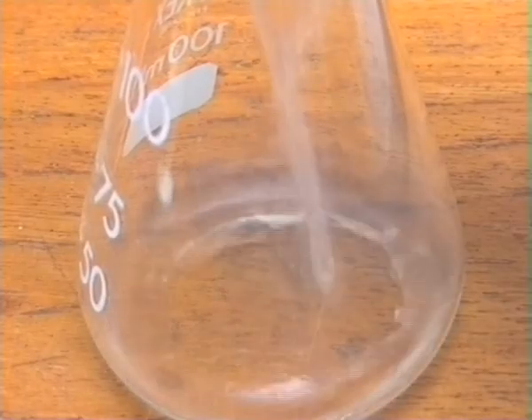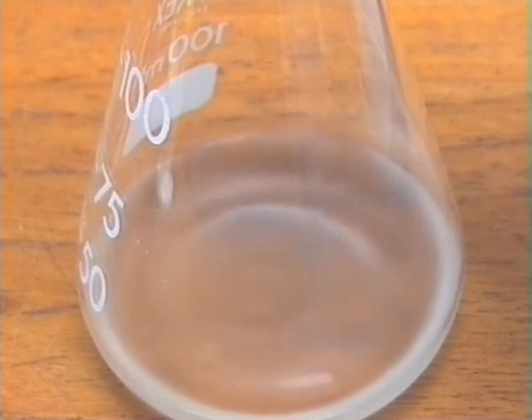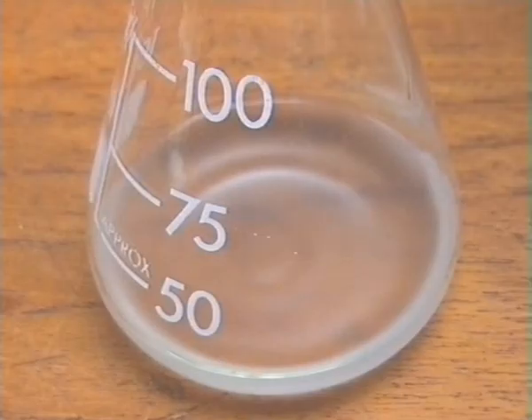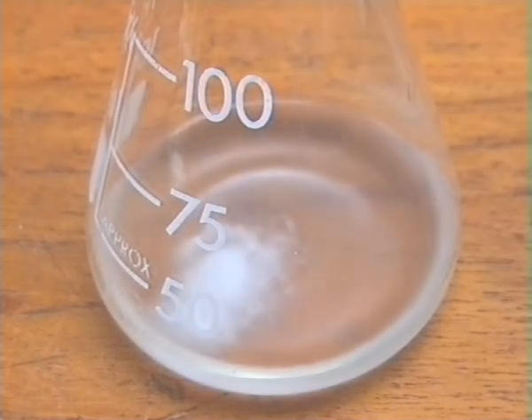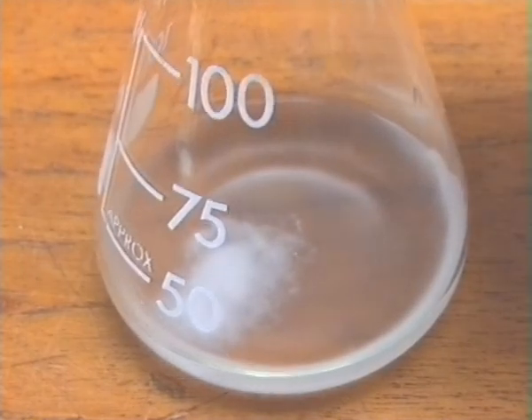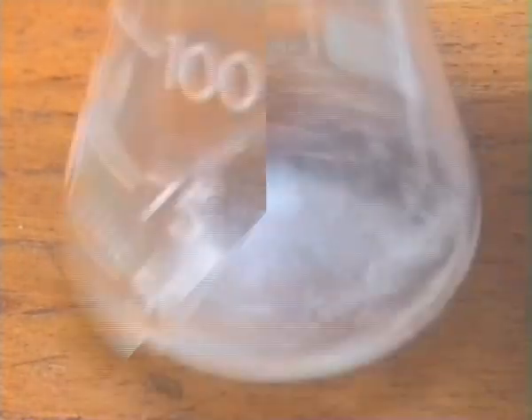The organic layer was run off into a clean conical flask and dried with anhydrous sodium sulphate. The milky colour of the organic product is due to the formation of an emulsion with the water impurity. This will clear as the drying proceeds.